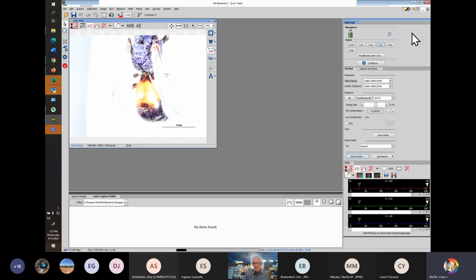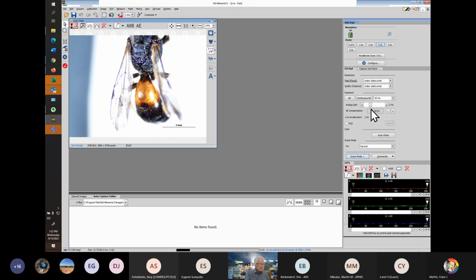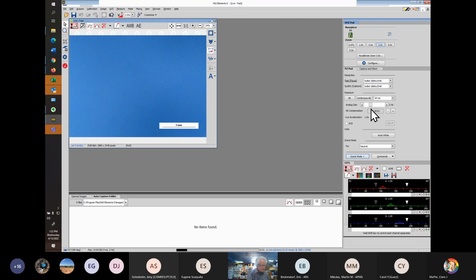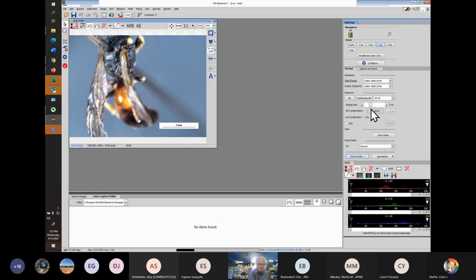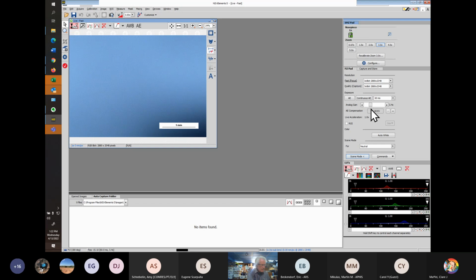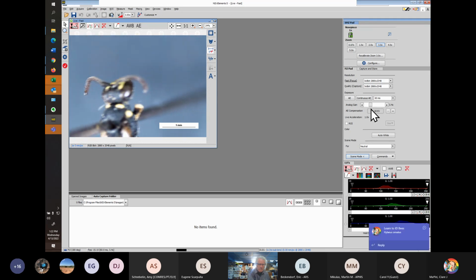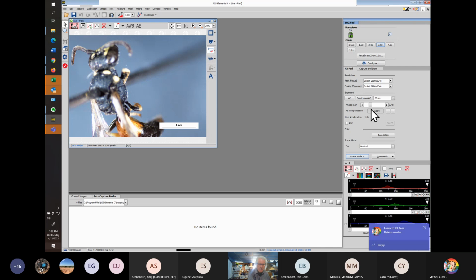I got pulled into another conversation for a second. Can you repeat what species you have on deck? Yeah, this is ornatus. So this is Hylaeus ornatus. And you're also showing us in the small screen. Okay, now I'm going to zoom in and go full screen on you to the pitting on the scutum.